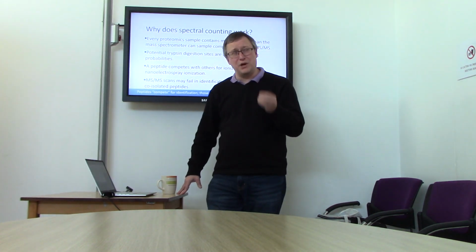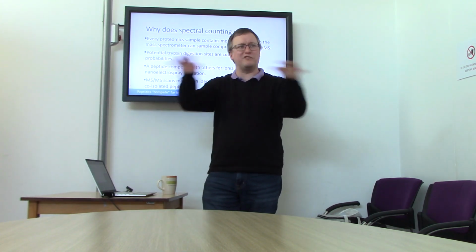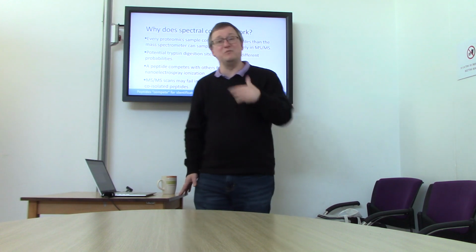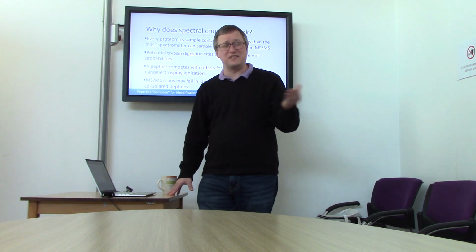The peptides must compete for protons. There's this thing called ion suppression: if you have a whole bunch of peptide ions that are all trying to ionize at the same time, there's just too few protons to go around. Some of them don't ionize to begin with. And certainly, you may produce an MS-MS scan that fails identification too.